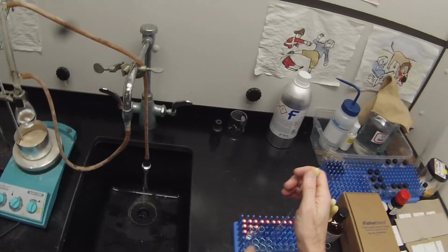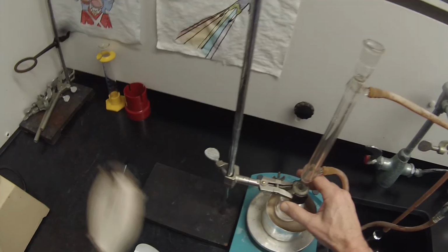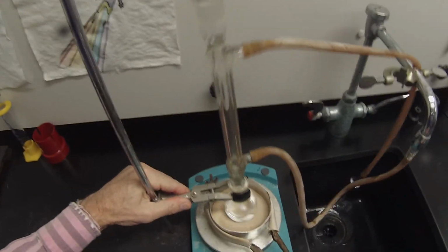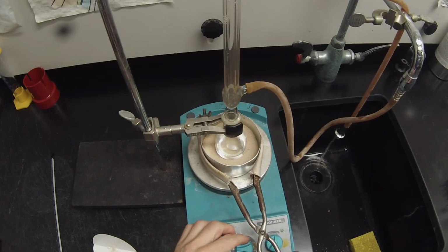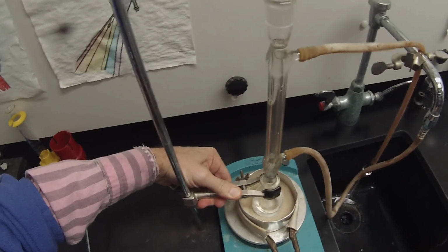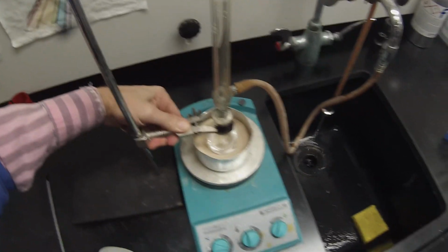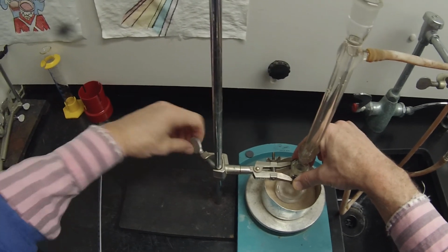So we're stable. We're now about 151, so that's good. So I'm going to take my first aliquot before I add the para-toluenesulfonic acid monohydrate, but what I want to do now is sink this down. Take that thermometer out so I don't break it. And we're going to sink this into the sand bath as deep as we can, so that it's close to the bottom of the bath. And crank our, oops, wrong dial, crank that up to about 450 so we get a nice stirring rate. We'll put our thermometer back.